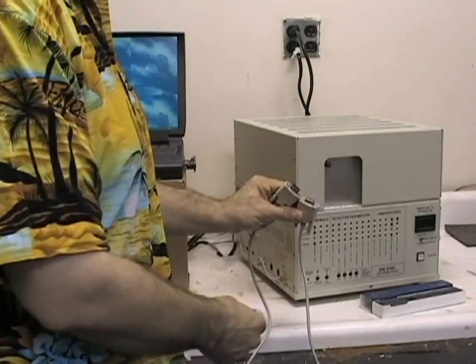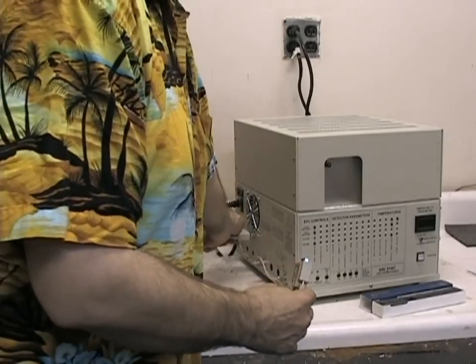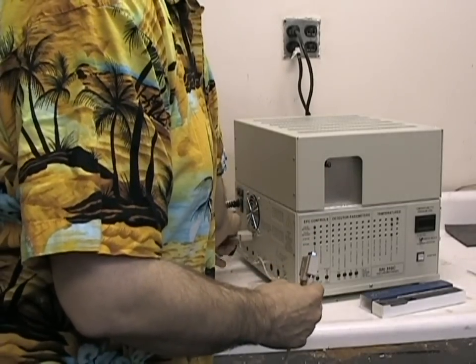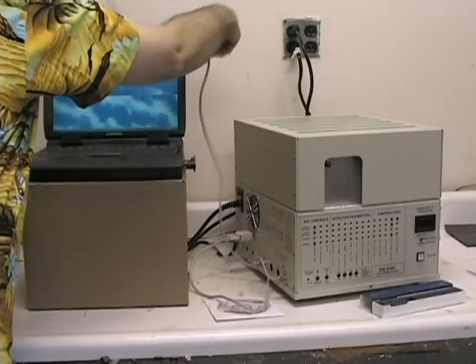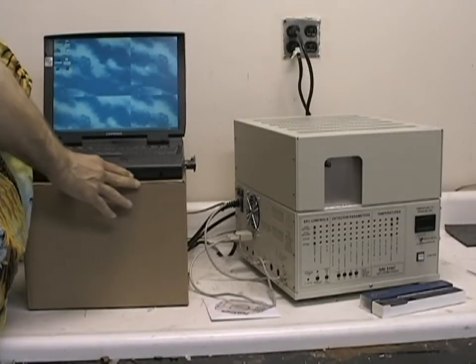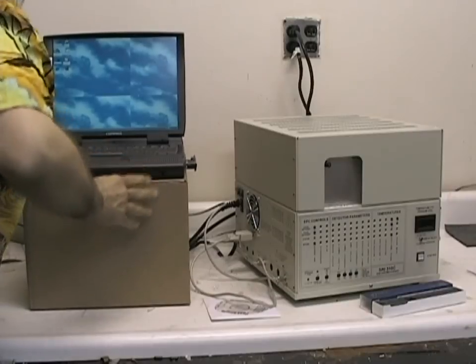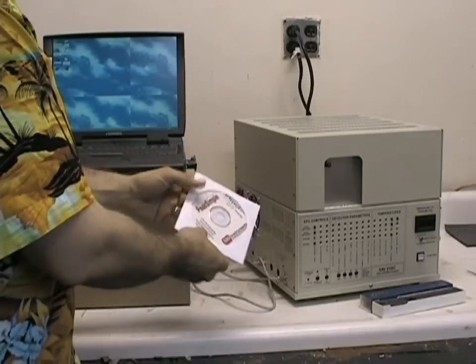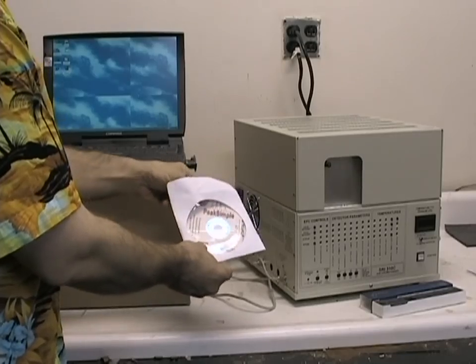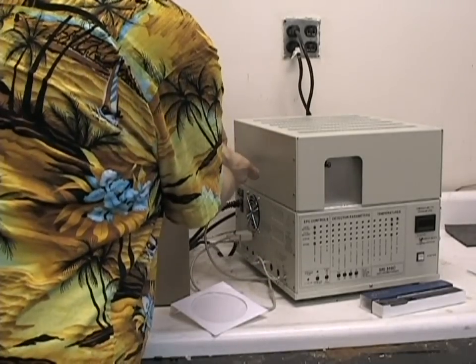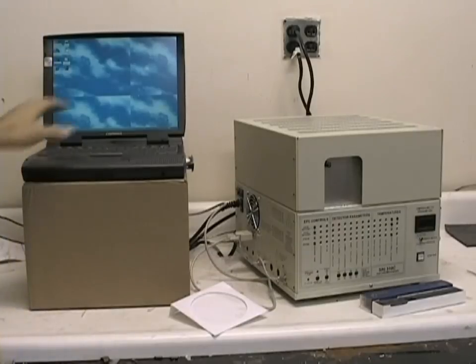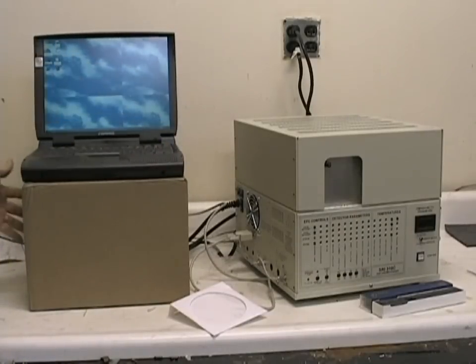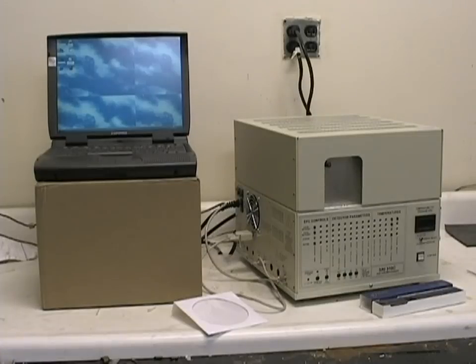The interfacing between the computer and the GC is done with a 9 pin serial cable which is connected to the GC and to the 9 pin serial port on the back of the computer. You will either have a floppy disk or CD-ROM containing the peak simple software and this is installed on your PC to allow control of the parameters on the GC.